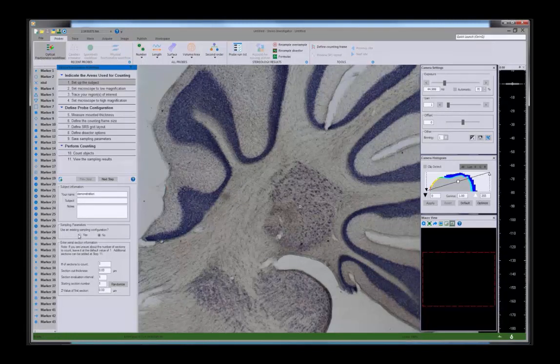Okay, this has to do with our section interval. I'm going to use an interval of not 8, but 10. We're going to look at every 10th section. There's 80 sections total, so that means we'll end up looking at 8 sections. These sections have been sectioned at 60 microns, but there's going to be shrinkage, and we're going to measure that. We don't want to start at section 1 every time, so we randomize the starting section. In this case, we're starting on section 2.